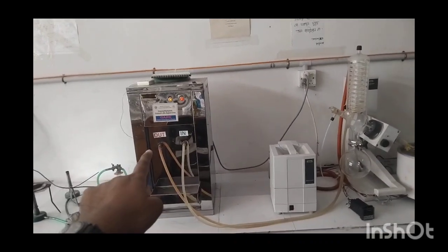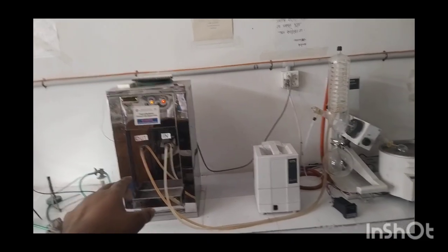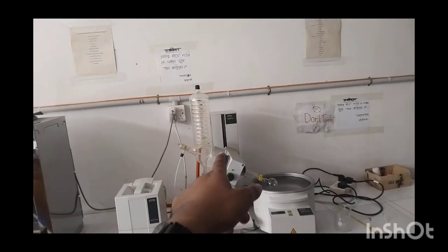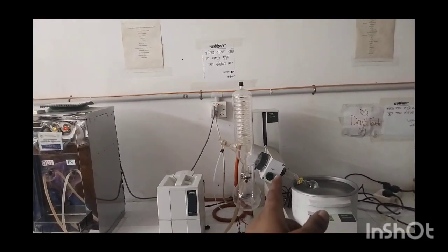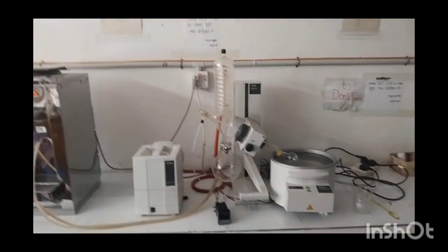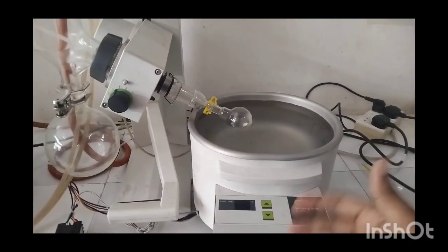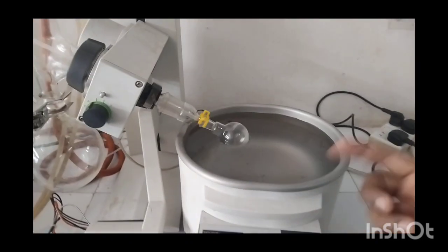So that's it. In the left hand side you are seeing that it's another part or component of this specific system. The function of this component is to cool the water, and this cool water is transferred to this specific tube that is located in the Rotavapor portion, and it will condense the solvents.